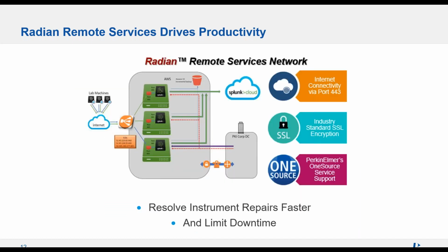It's just a simple connection. Everything goes through a secure communication. It's all encrypted, standard encryption technology to the cloud. It's just diagnostic data, so it just has the instrument serial number and the diagnostic data, nothing with the actual analytical data. That's not what we're monitoring. It's just the diagnostics on the hardware itself.